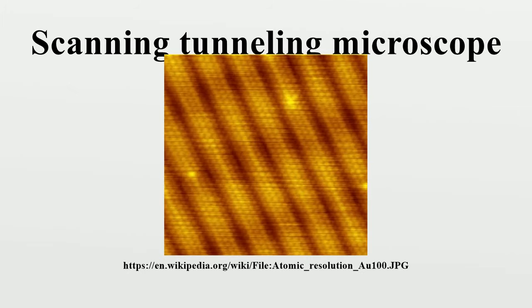Aside from modifying the actual sample surface, one can also use the STM to tunnel electrons into a layer of electron beam photoresist on a sample, in order to do lithography. This has the advantage of offering more control of the exposure than traditional electron beam lithography. Another practical application of STM is atomic deposition of metals with any desired pattern, which can be used as contacts to nanodevices or as nanodevices themselves.